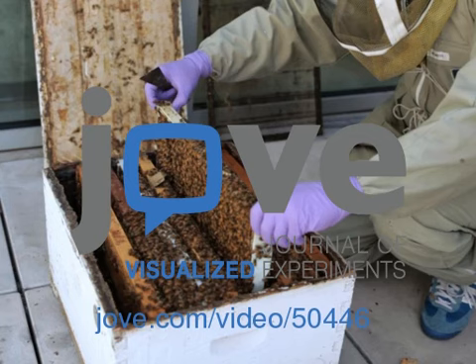It usually takes around 2 minutes to test 20 bees using 1 concentration of sucrose. Therefore, there should always be more than 20 bees in each group. If a bee fully extends its proboscis, a positive response is counted.